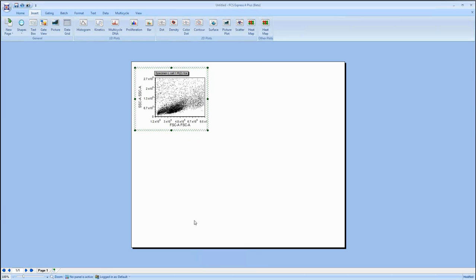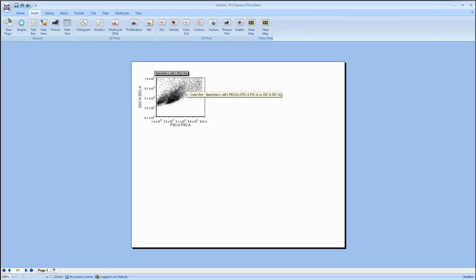And you can always come in if you need to magnify more. You could always come in here and try and grab a closer up area and zoom in on that a little bit more. But with the Attune data, I think using this Magnify Resolution tool is going to be something very important for working with some of this data. It's something that people who are using the BD Accuri C6, who are working with a 7-decade log scale, use quite often as well. It's just one of those things of having such a large dynamic range, which is a great thing in my opinion, but being able to zoom into the relevant portion of that data in the range, making that easy, is something that we try to excel at.